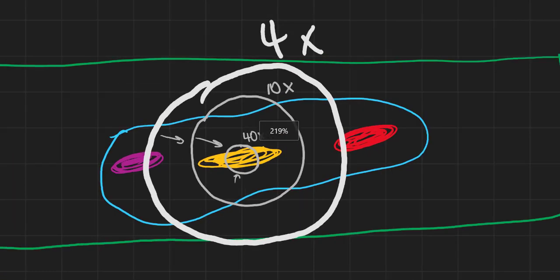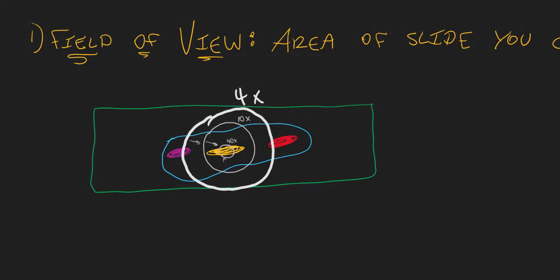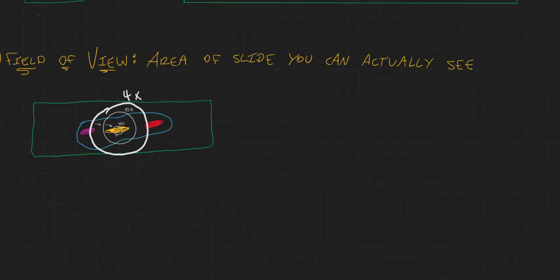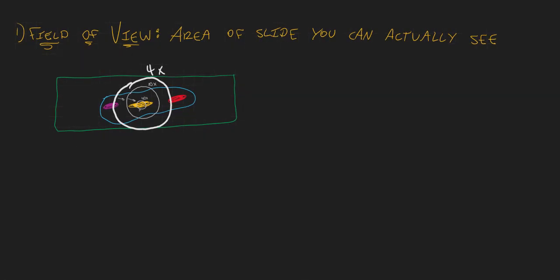Okay. This is the first relationship between different factors that affect microscopy that you need to know.